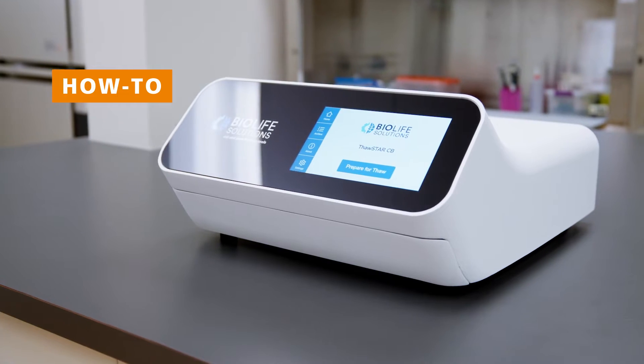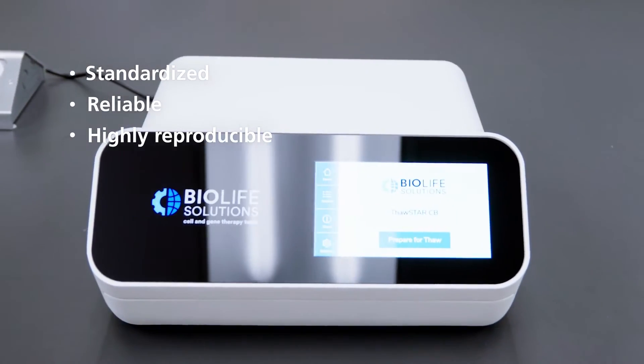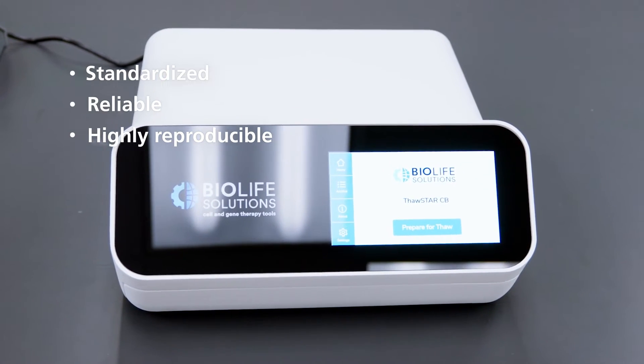The Thawstar CB automated thawing system permits standardized, reliable, and highly reproducible cell thawing as an alternative to a manual water bath-based method.